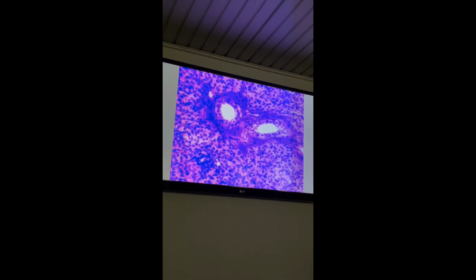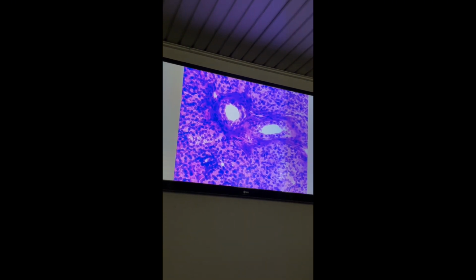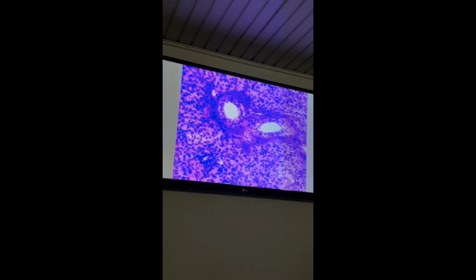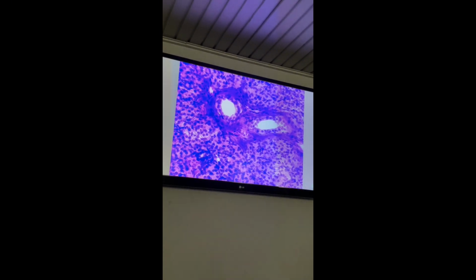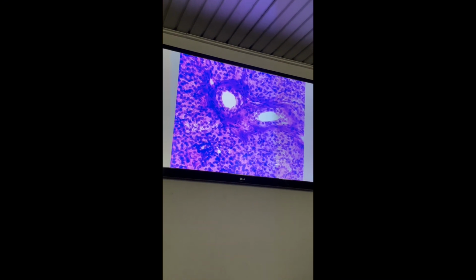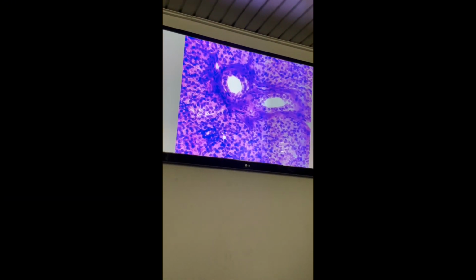The intralobular ducts converge and drain by interlobular ducts found between the lobules. Each interlobular duct is surrounded by connective tissue. The lining epithelium of interlobular duct is simple or stratified epithelium. It is either cuboidal or columnar.